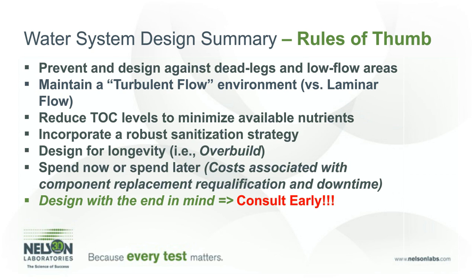We also want to reduce our TOC levels to minimize available nutrients to these organisms, as well as incorporating a robust sanitization strategy. Designing for longevity or overbuilding for the system is key as well. It comes down to spend now or spend later. Costs associated with component replacement and even requalification and downtime can skyrocket. Design with the end in mind and consult early.